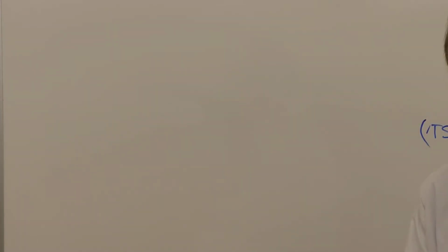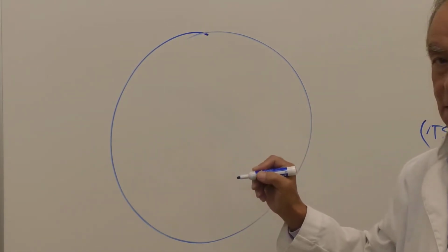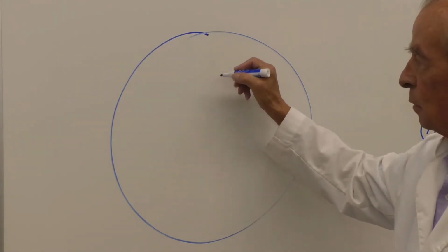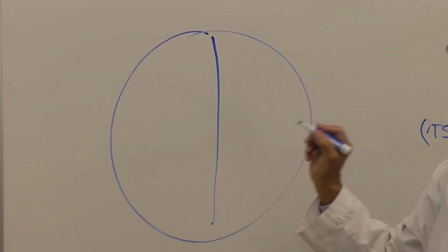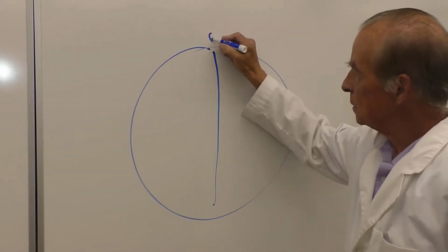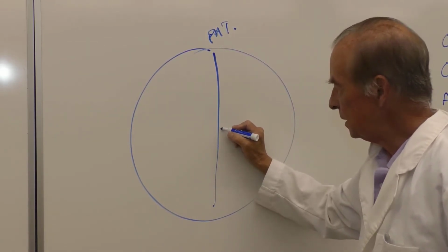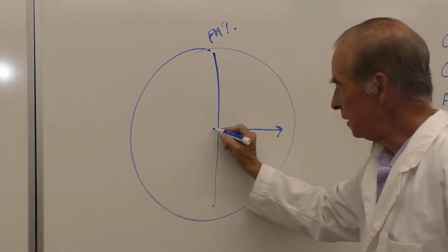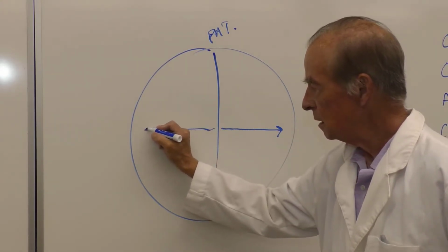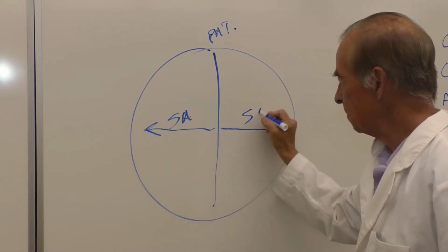So let's diagram what we did with respect to the CAMP test. So here's our blood agar plate. It's the patient's swab, or the known culture, single streak down the center. And this is the tricky part. So this is patient. You get as close as you can to the streak outward, here, and here. And that's our Staph aureus.